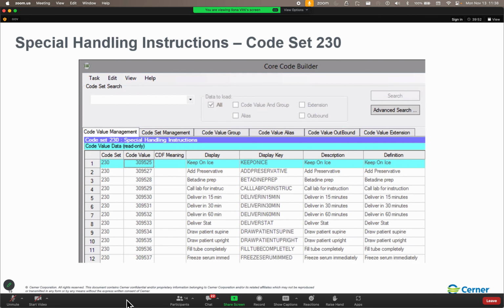Now, folks, same accession class, same accession format, we've got control over that on our side. That is part of the database build. The user will have control over making sure they have the same requested start date and time, the same collection date and time. Same conversation ID with the netting server, that actually gets kind of tricky. Because what that is saying is that the orders must be in the same data packet that we send to the netting server so that they can have the same conversation ID on the netting table.